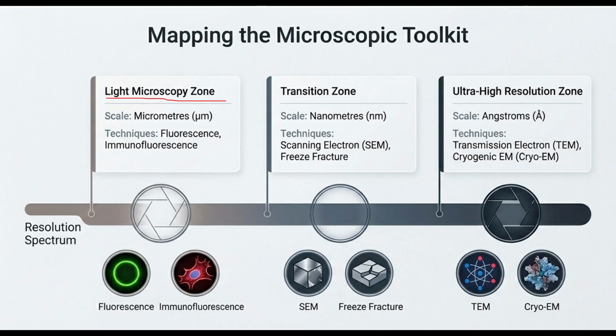Clear? So moving towards higher resolution, we encounter electron microscopy. Okay, techniques such as scanning electron microscopy, right? Freeze fracture microscopy, etc. Okay, this is a transition zone.